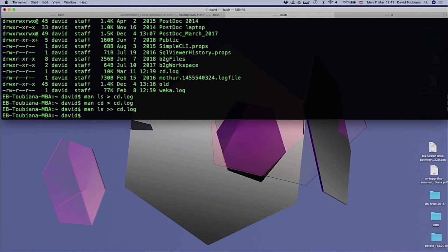That's the one before, when Juan used grep. It was very important that you use the quotation marks to put the greater than sign in, because otherwise it would have just put grep into a file that you specified later on. It happened to me several times, and I lost all the data that I had, so be careful with that.